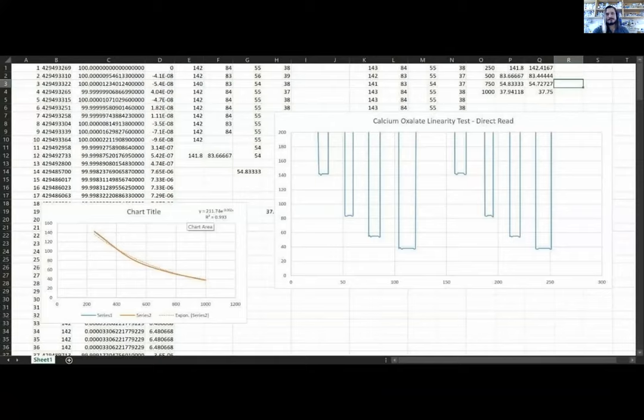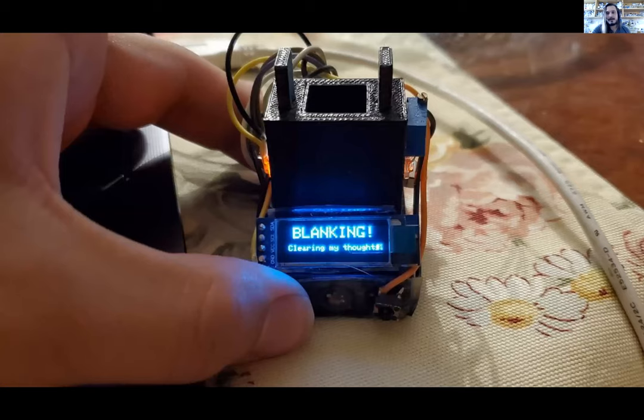And then calibrate. So I did a whole bunch of math. The linear regression R squared value is 0.99, which is good enough. You know, I'm not complaining. But more importantly, this entire device cost me maybe $2.50 to produce, right? As opposed to $1,100 or more. So that was one of my favorite little devices. And I put in a little screen, and you can. This is a rough prototype without any soldering and just essentially connect everything to a small Arduino mini.